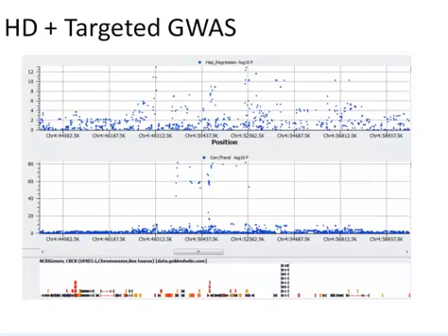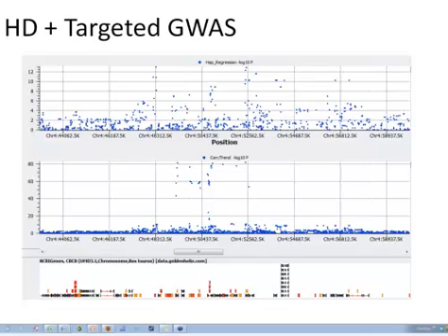Yes, so there are a number of quality assurance and other statistical analyses beyond just the association test in the software. Population stratification is one of those, and we have a number of researchers doing not just human genetics but plant and animal genetics who use the population stratification within the software to correct for that.